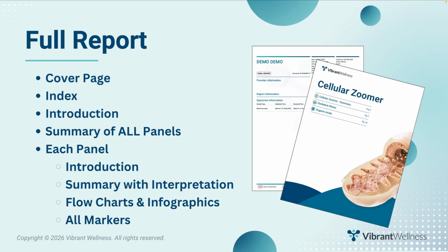Let's start with a quick overview. The Cellular Zoomer report includes a cover page, an index, introduction, and a summary of all the panels. Then, you get a full report for each panel included in the Cellular Zoomer. Each full report includes an introduction specific to the panel, a summary with panel-specific marker interpretation, including flowcharts and infographics, and then ends with a list of all the markers for that panel. Let's dive in.